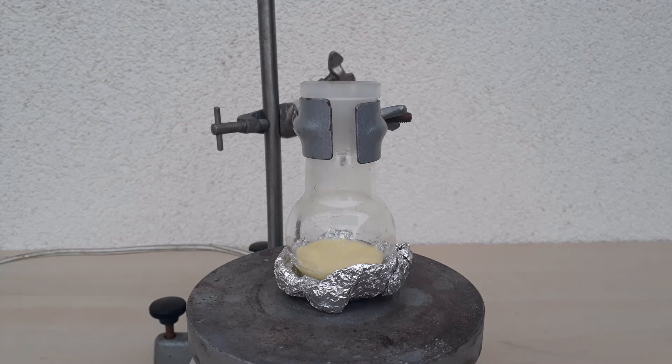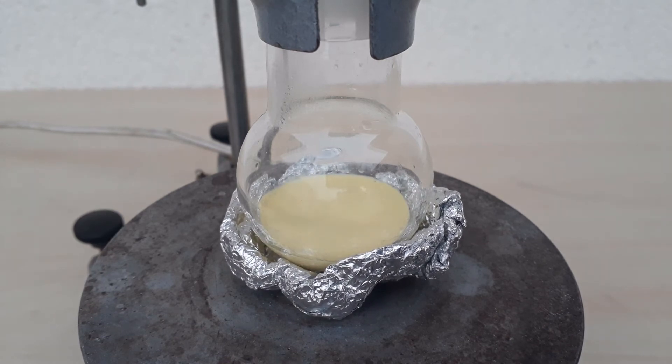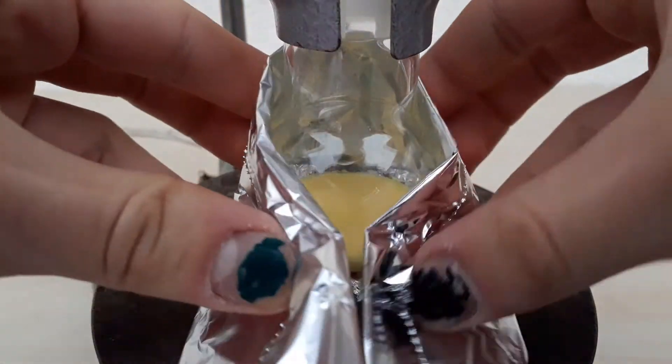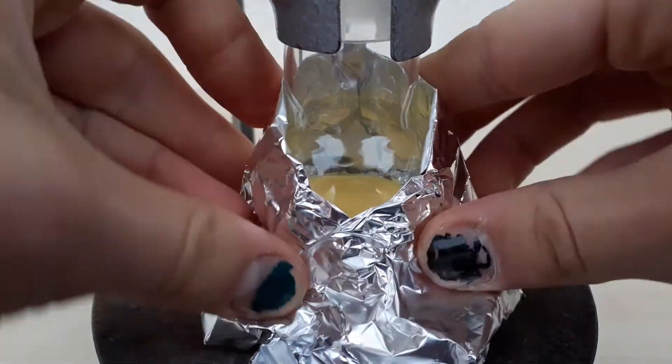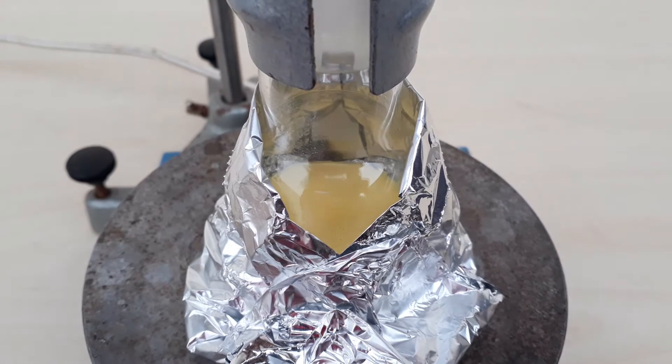I set up the experiment outside and started heating the reaction mix. You can see that already a nice tinge of yellow is developing. For this reaction to proceed at a good rate, it needs to be pretty hot — I achieved this by putting the hot plate to 300 degrees Celsius and also wrapping the flask in aluminium foil.